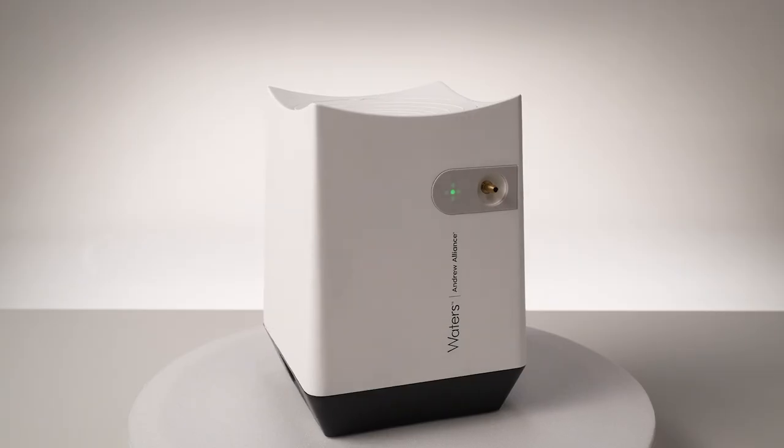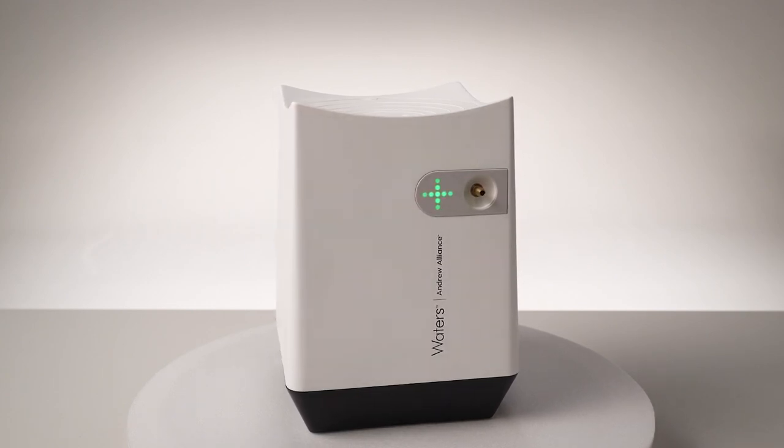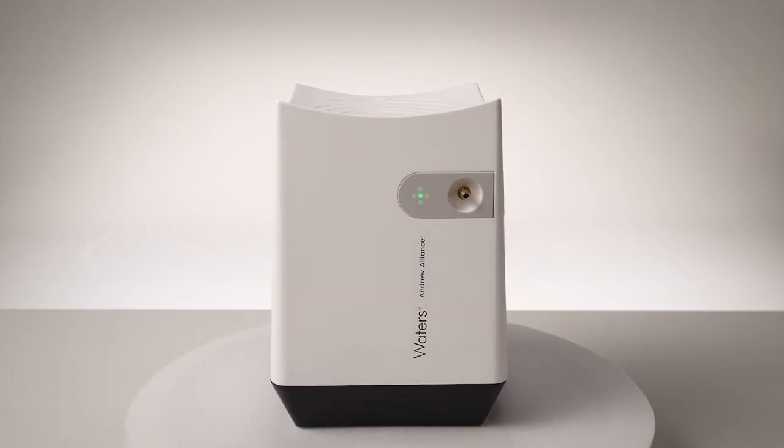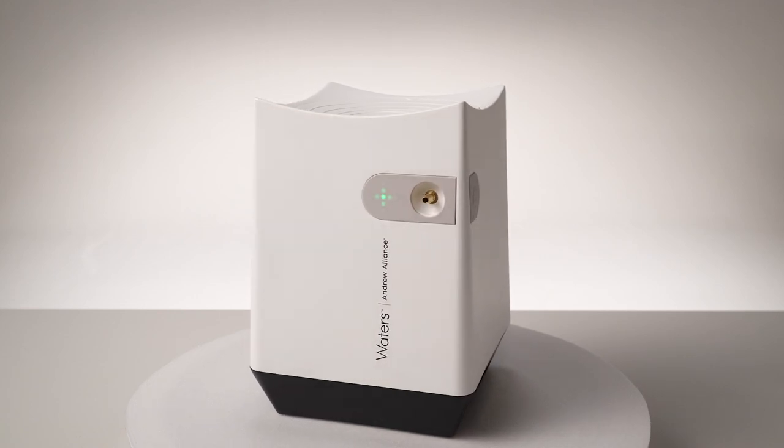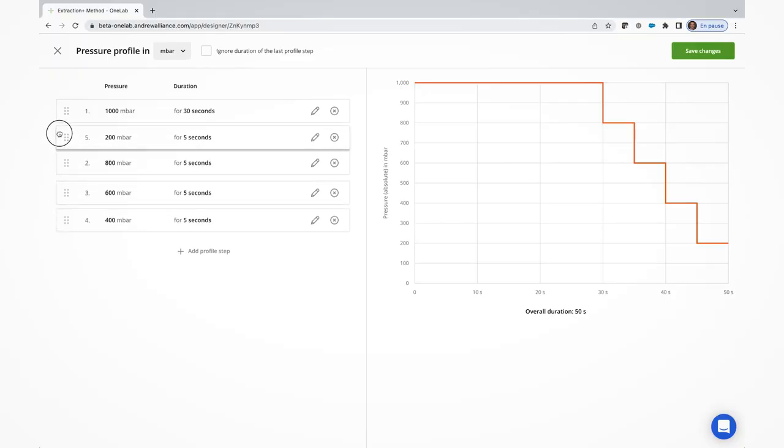Starting with its main components, the device has several key parts. The first is a completely new pump with full connectivity to the OneLab software built right in. This connected pump allows for automated pressure control during a run, enabling a user to program a pressure profile that will be strictly followed during protocol executions without any manual interventions necessary.